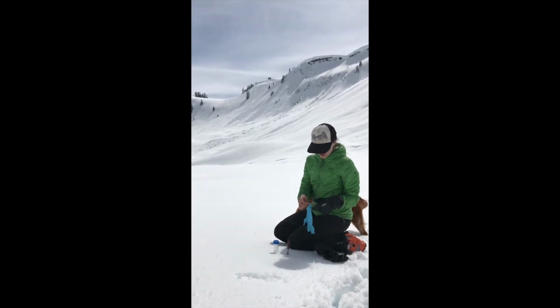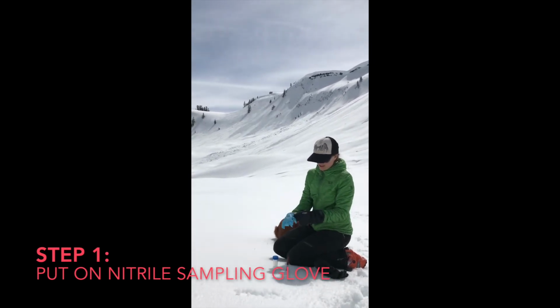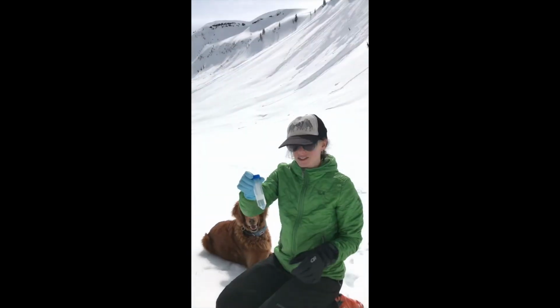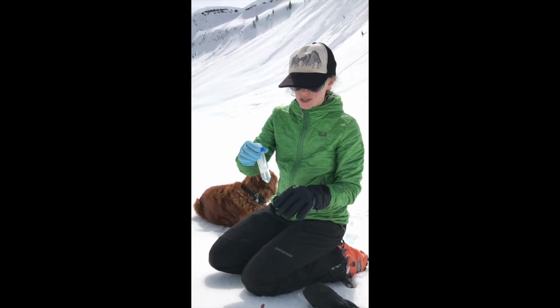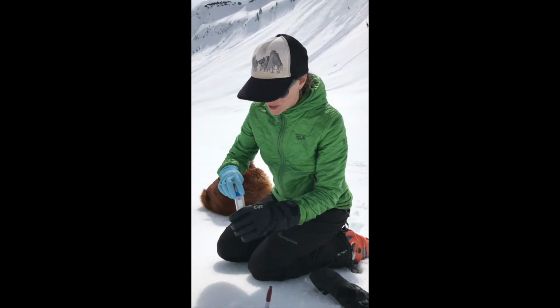I'm going to put on my nitrile glove. Inside of the tube is RNA later, which is a preservative for nucleic acids. That's great. It's just a really salty solution. It won't make you sick, but don't drink it. But it's okay if you spill a little bit.